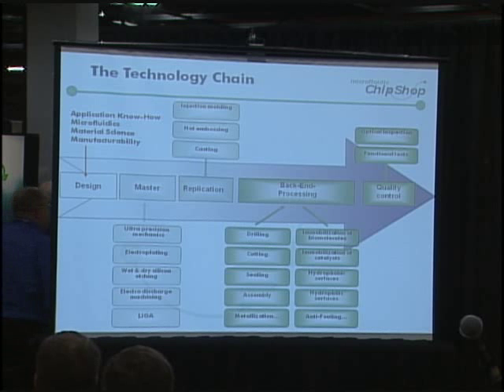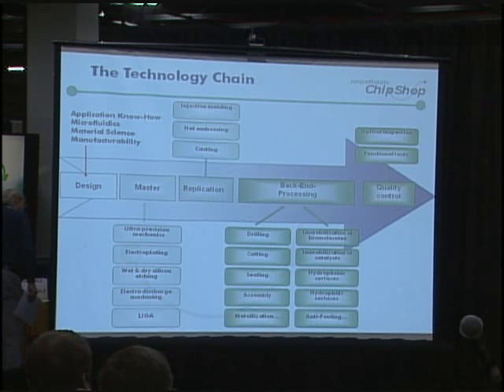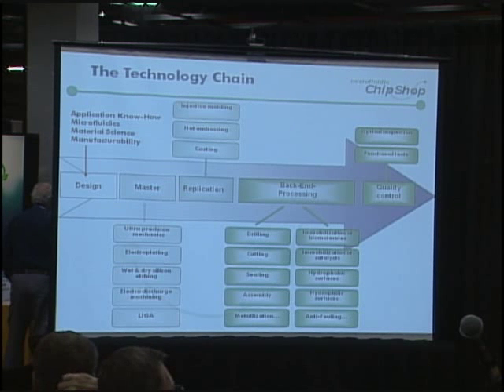If you want to go down to even smaller structures, you have to do lithography and electroplating. We can make very, very small structures that way, but you're basically limited to one height level. And then there are a couple of other, let's say, more exotic microfabrication methods. We have access to all of them, but the first two we have in-house, and these are our preferred means.